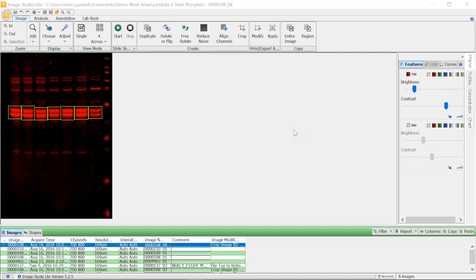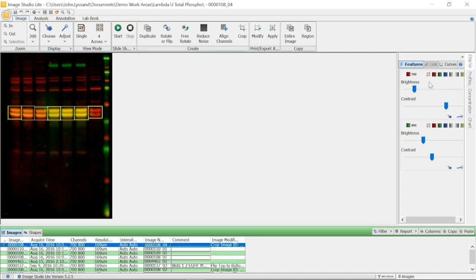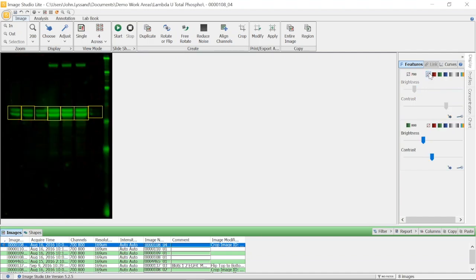After running the gel and transferring to a membrane, a Western Blot was performed to detect pan-ERK protein in the 700 channel, shown here in red, and phospho-ERK, shown here in green, from the 800 channel.